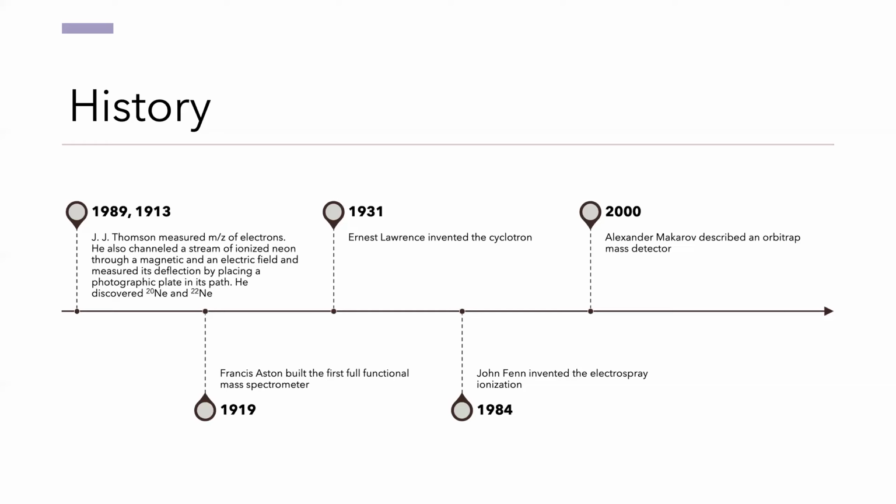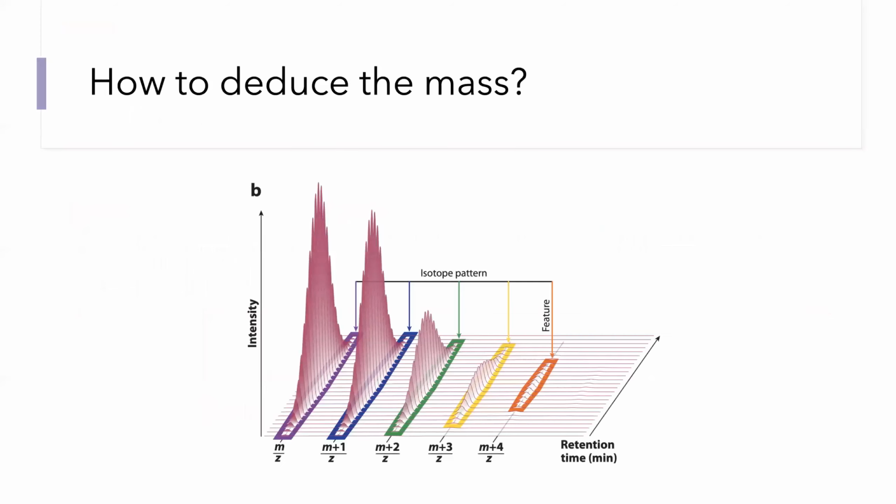This technology was further developed by Thermo Scientific and continues to be widely used. Another very important mass detector that allows measuring mass to charge ratio with high accuracy is known as time of flight, or TOF, instrument. And there are additional mass detectors. This history that I'm providing here, the overview, is clearly not intended to be exhaustive, simply highlighting a few important milestones.